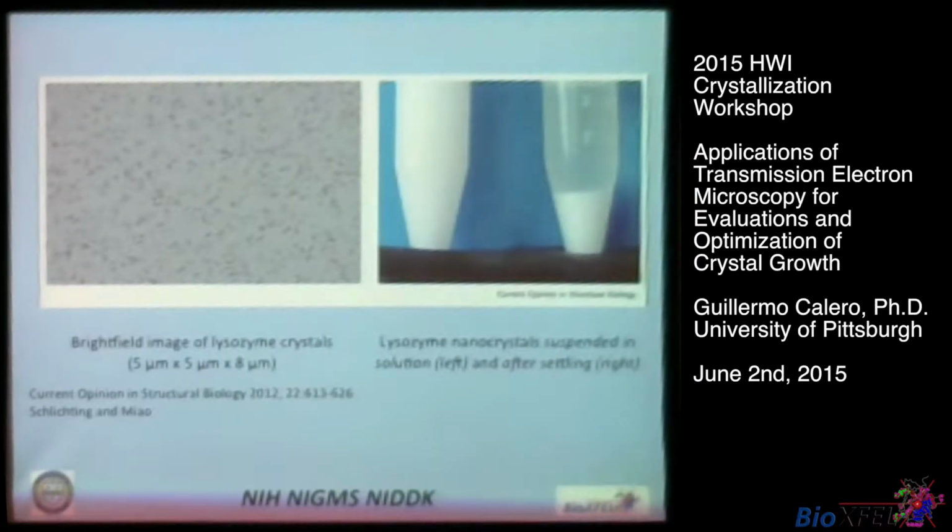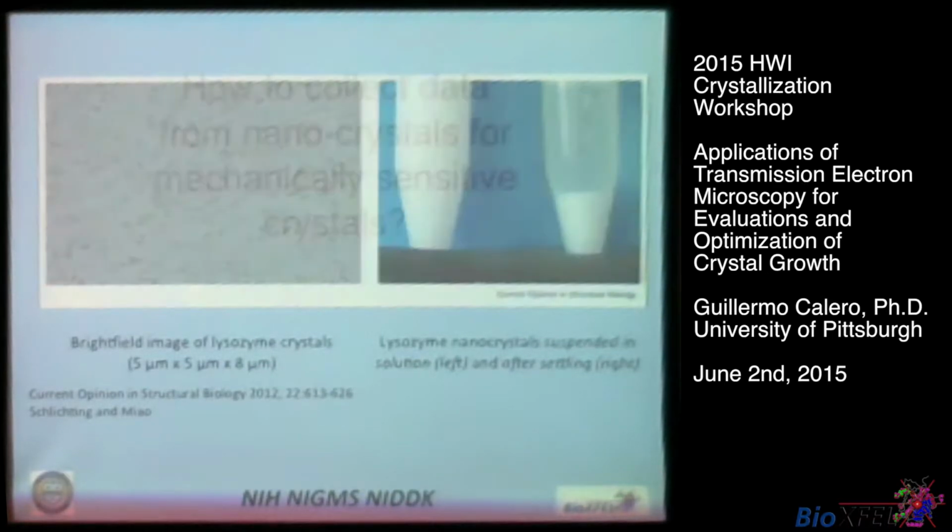The second problem is that for me to grow this number of crystals, it requires hundreds of liters of polymerase. So for me, that's not really a good scenario. Of course, things have gotten better now, and injectors use much lower quantities. But at this time, I wanted to be able to shoot the nanocrystals that I had discovered.